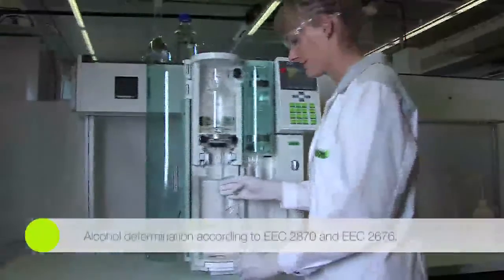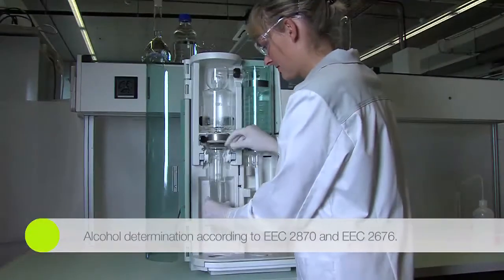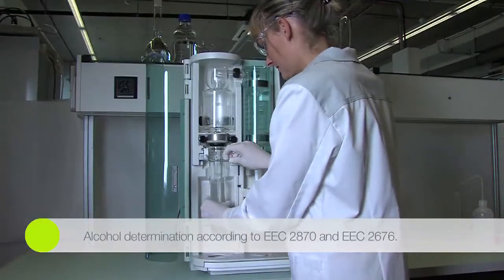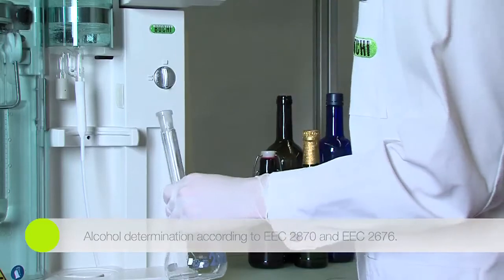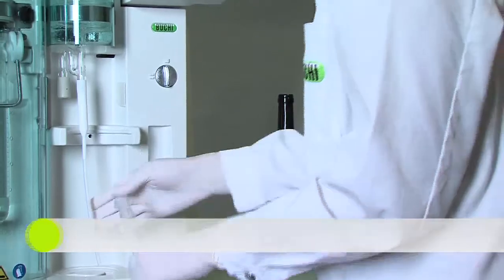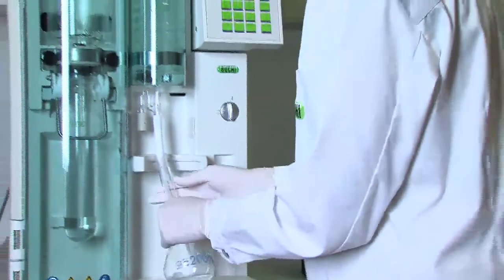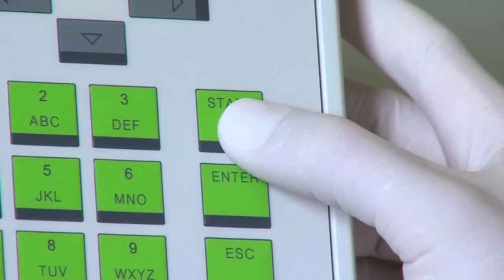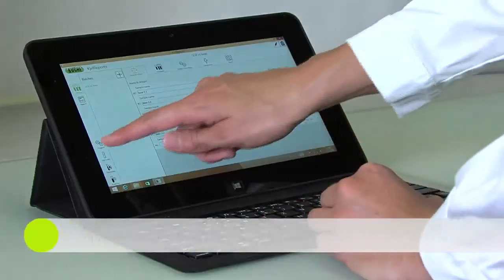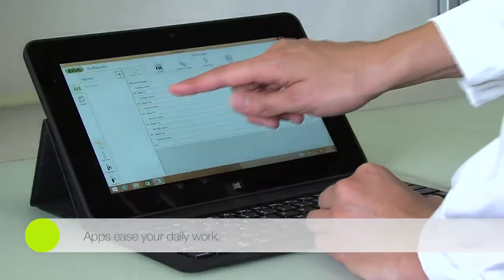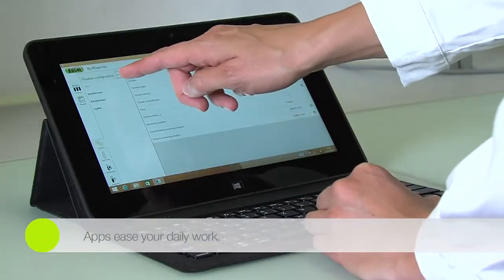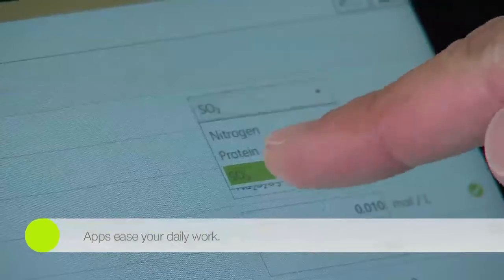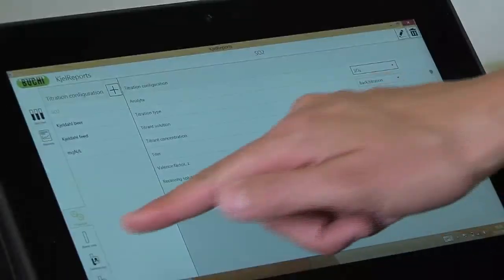The officially recognized method for the determination of alcohol concentrations in beverages is measuring the density of the distillate. Smart accessories for individual applications help to provide reliable and reproducible results aligned with official regulations. Strong customer relationships result in a growing number of practical apps facilitating your daily routine.